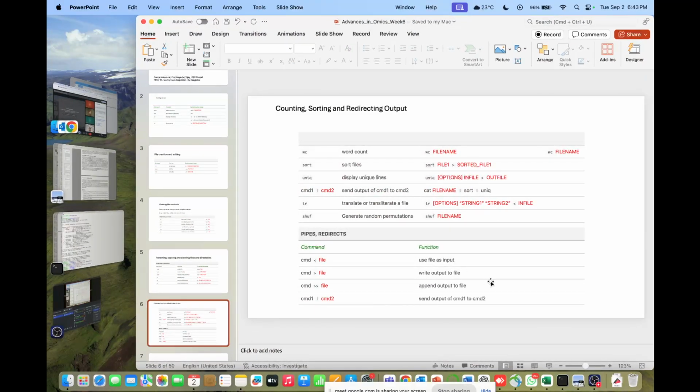Okay, I think this is fine here. The rest of them are not so important. I'm touching the important parts, so that if you want to start off with some data analysis using genomic data or something else related to omics data using Linux commands, you can get started, because these are not so difficult. If you start working on these commands on a Linux system on a regular basis, you'll get used to them. So it's not that difficult.